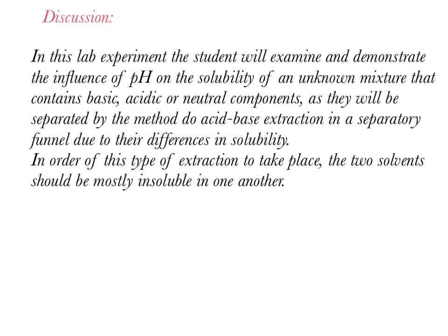In this lab experiment, the student will examine and demonstrate the influence of pH on the solubility of an unknown mixture that contains basic, acidic, or neutral components, as they will be separated by acid-base extraction in a separatory funnel due to their differences in solubility. For this type of extraction to take place, the two solvents should be mostly insoluble in one another.